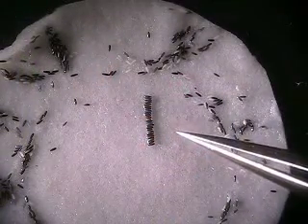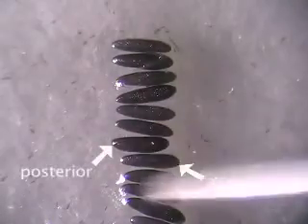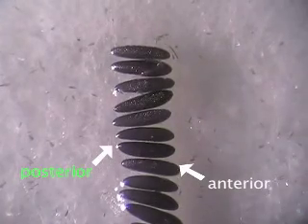All embryos have to be in the same orientation. They have two poles: anterior and posterior. We are going to inject into the posterior end. The anterior side is a little bit wider than the posterior.